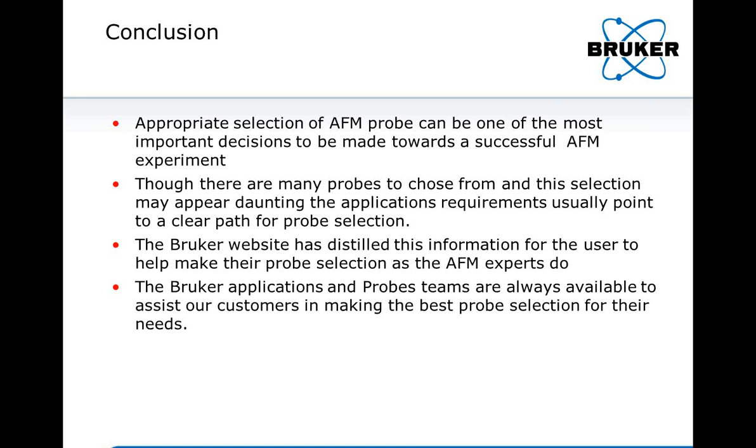This question came in before you did the cleaning, but I think it's probably still relevant. In order to preserve AFM probes, to what degree of vacuum or desiccation is required? Is 100 millibar enough? So in general, we don't find that storage in vacuum is required. We've been able to image at high resolution right out of the box. Please follow up with what specific problems you're having with your imaging or contamination.